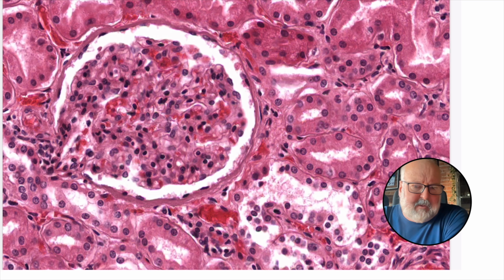I've got to find some epithelium on here. And remember, epithelium faces the outside world or space. So when I look, I can start to see some spaces. So this is where I would start to really focus in. And let's start here. This is a big structure.